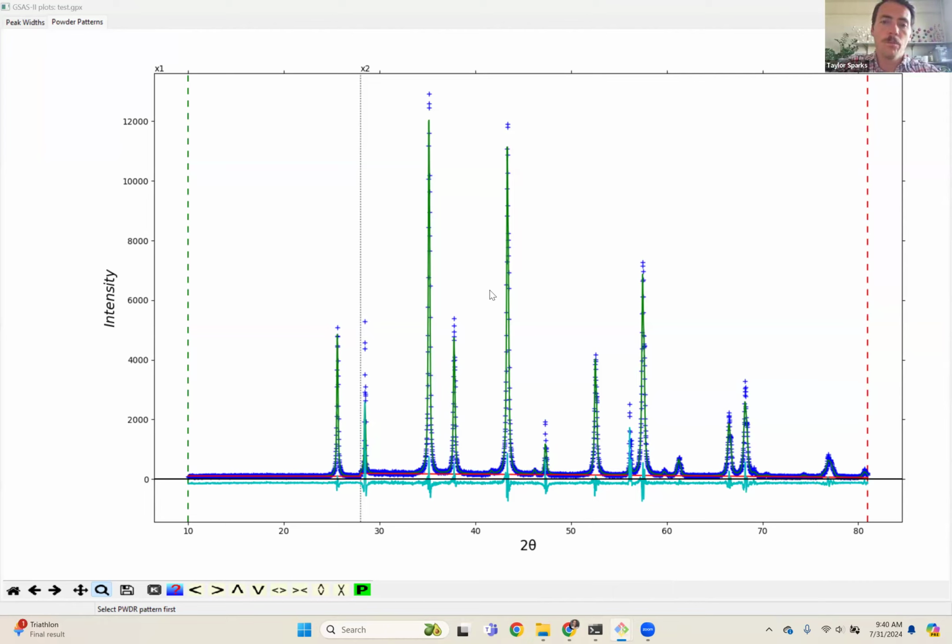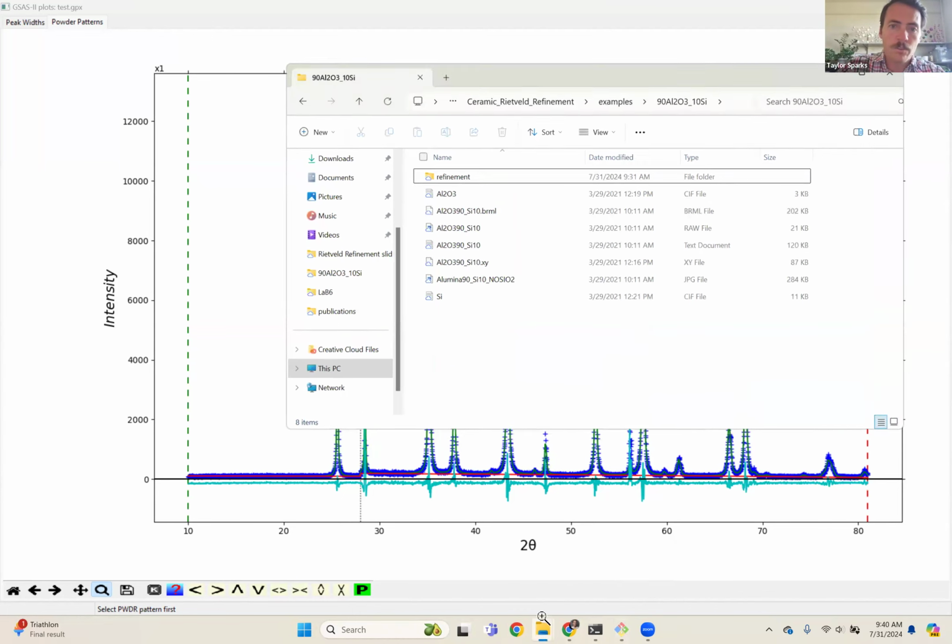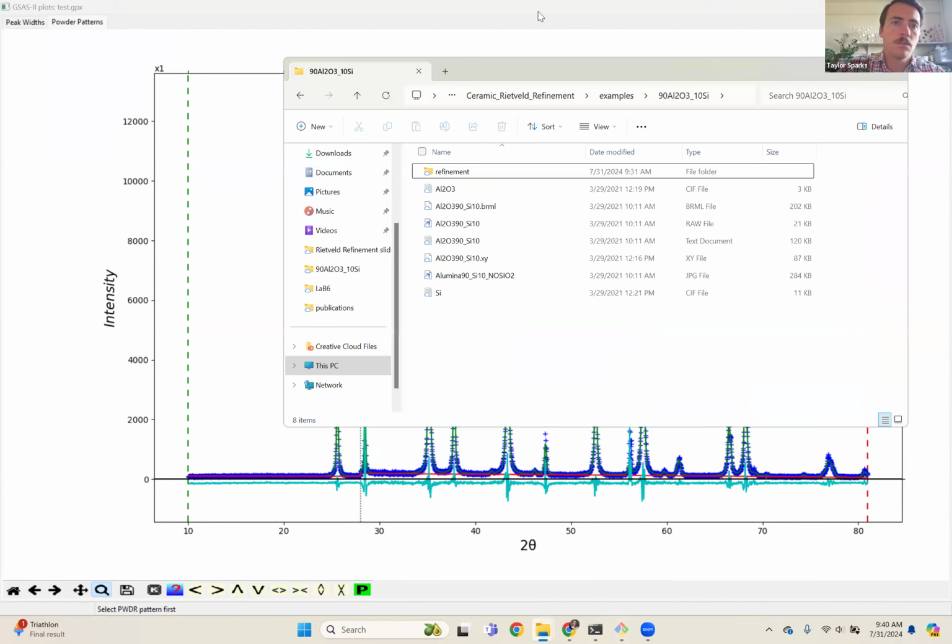Somebody said they could not open .txt. Which txt was that? Was that going back to the data we looked at? It wasn't any of these, so I don't know which one that was in reference to. You can type that in. It was a Rigaku, as opposed to a Bruker.